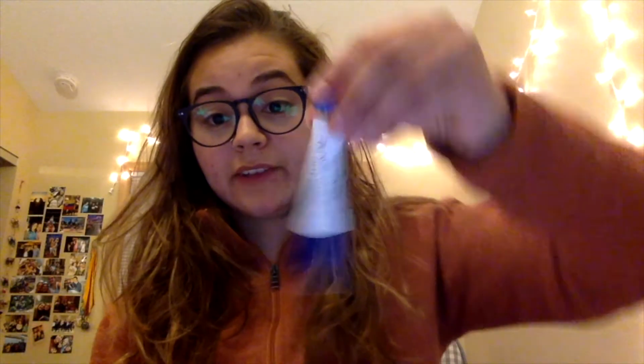Okay, so let's get started then. The first step is to prepare the blue rubbing alcohol. So you're going to take, with your pipette, 3 drops of your food coloring, and you're going to add it into the tube that has the rubbing alcohol. And you should mix it very well, and that should give you this blue rubbing alcohol. And we're going to set that aside for a second.